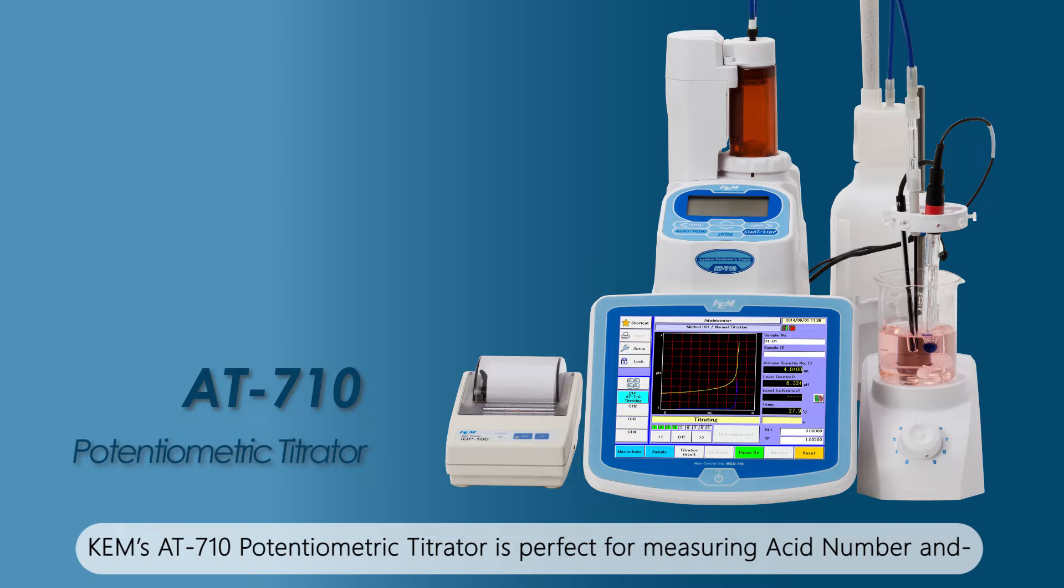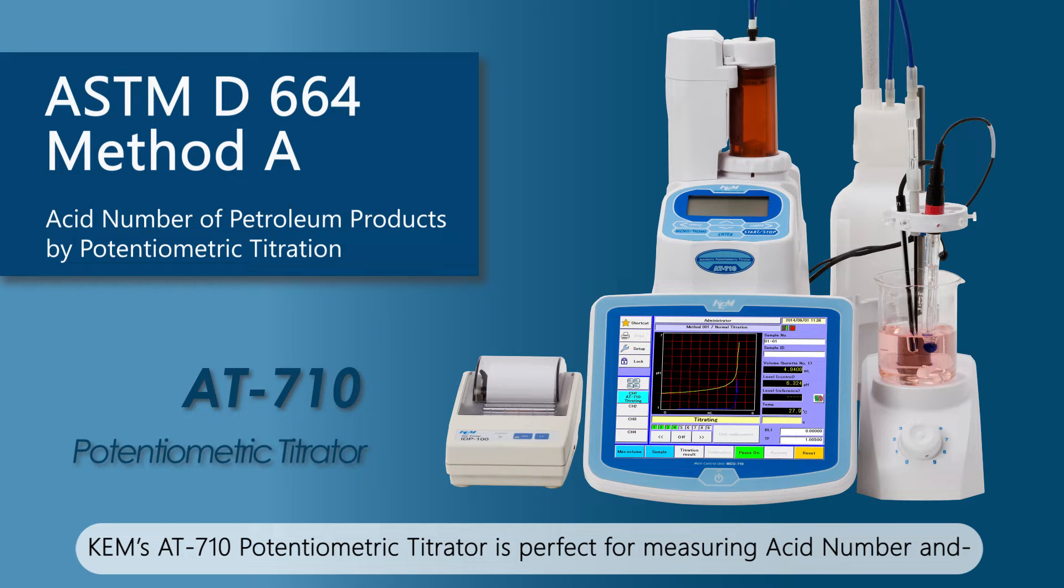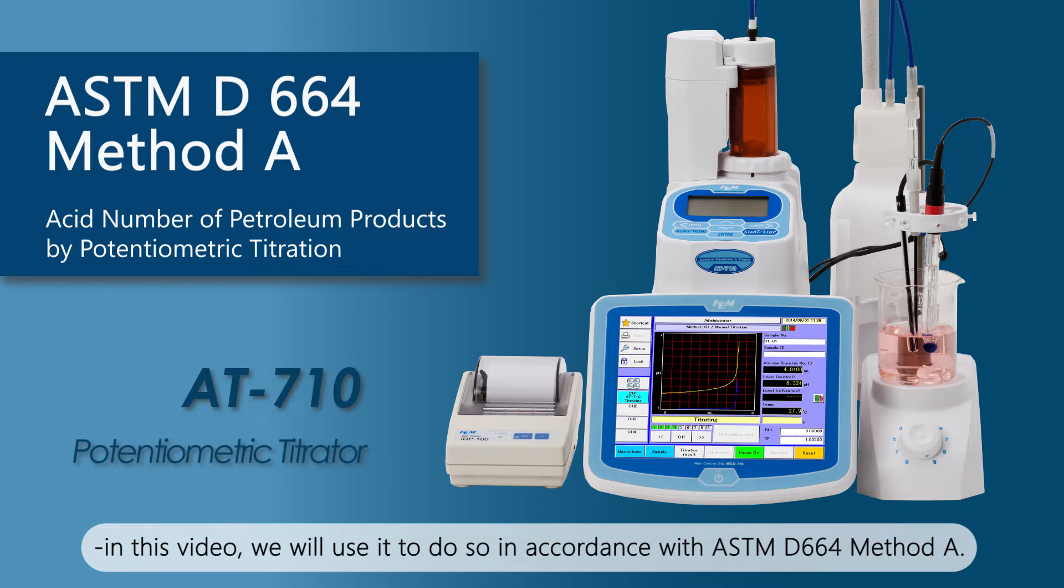KEM's AT710 potentiometric titrator is perfect for measuring acid number, and in this video we will use it to do so in accordance with ASTM D664 method A.